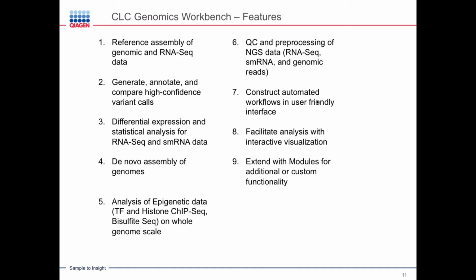Workflows, as I mentioned, you can construct end-to-end analysis workflows. Interactive visualization, so the dynamic linked views that I talked about and that we'll see in the demo. And then you have certain external modules available to extend features of your Genomics Workbench that we call plugins that you can apply to the workbench.